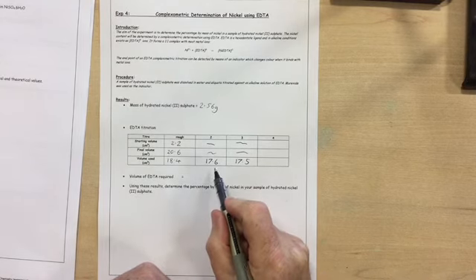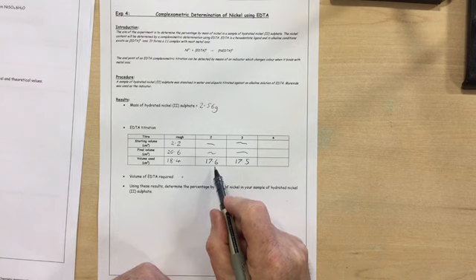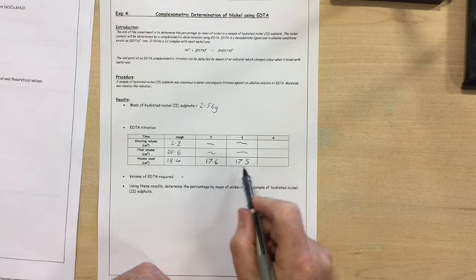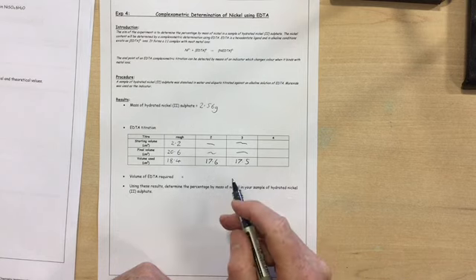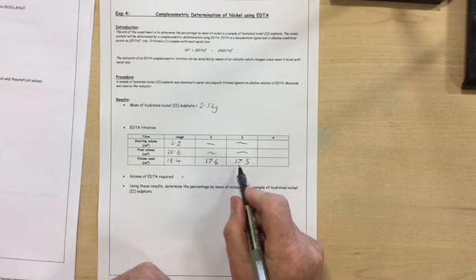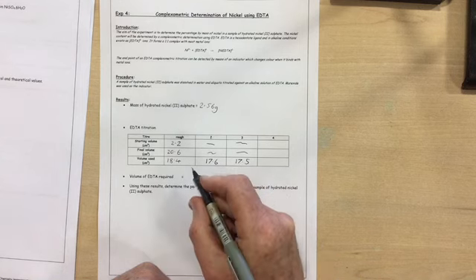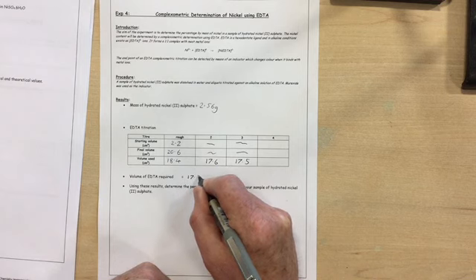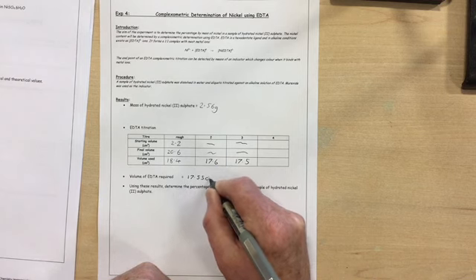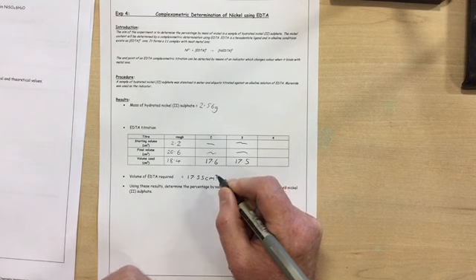So let's assume I've just done my titration and I got results of 17.6 and 17.5, so they're concordant. Taking the average of those two gives me a volume of 17.55 cubic centimetres for the EDTA.